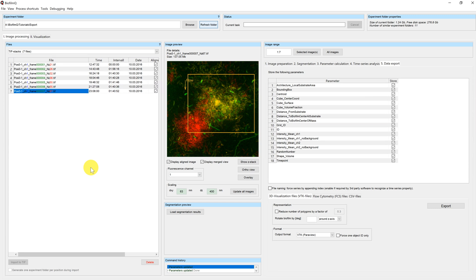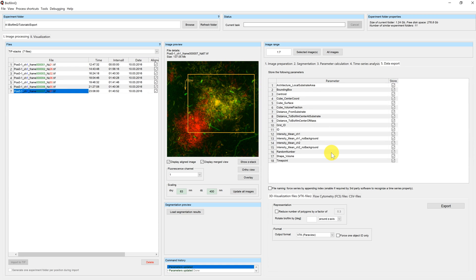To export the parameters to another file format we have to go to the data export tab in the image processing window. At the top you can find a table with all already calculated parameters. This overview is quite useful if you are unsure whether you already calculated a certain parameter or not.